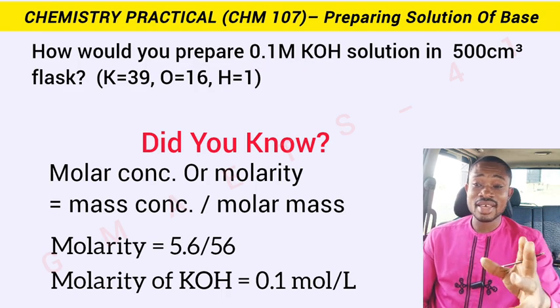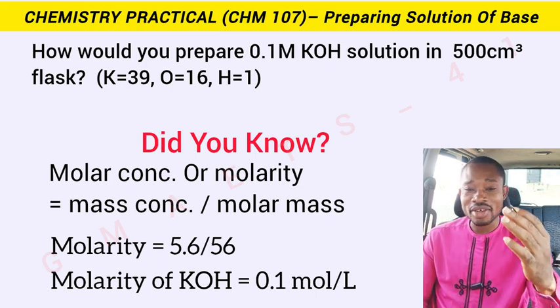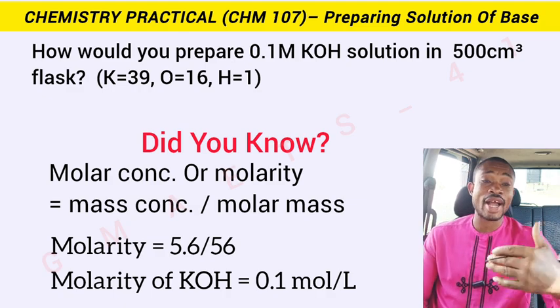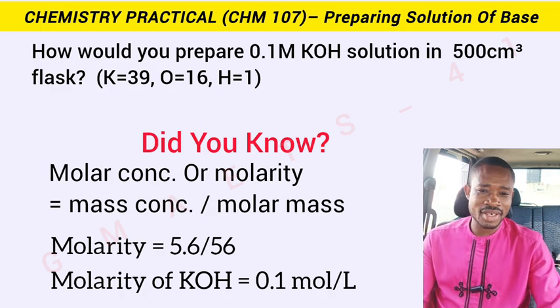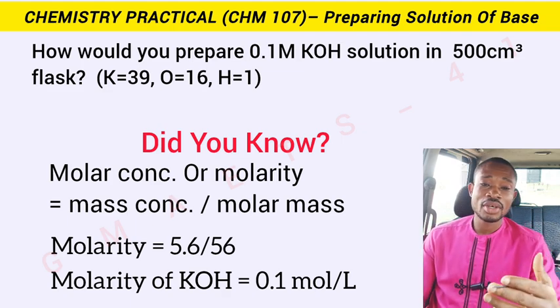And you know that in this case, you might not be given the molar concentration, you might not even be given the mass concentration. They will give you the statement in such a way that you can do the calculation yourself. So this is all about the procedure, and of course I've given you further information as per certain things you might have to calculate if you find yourself in the laboratory or in the exam hall.